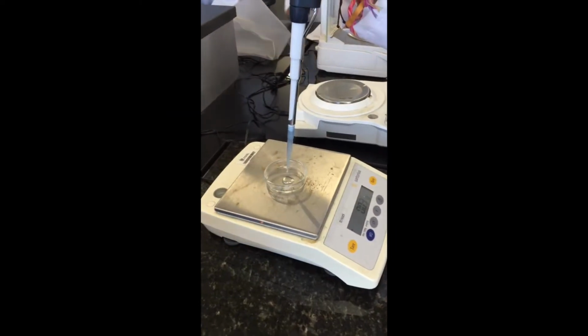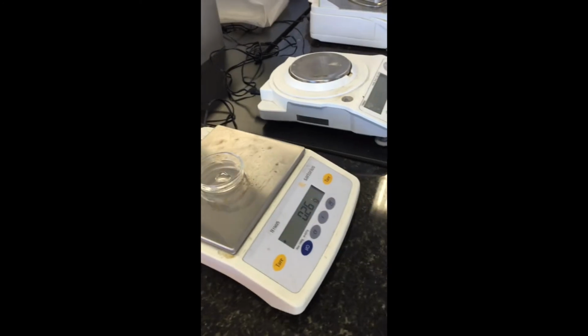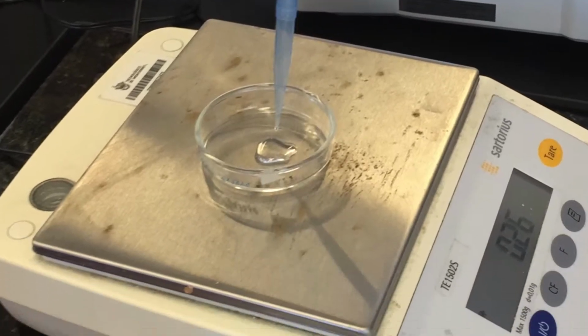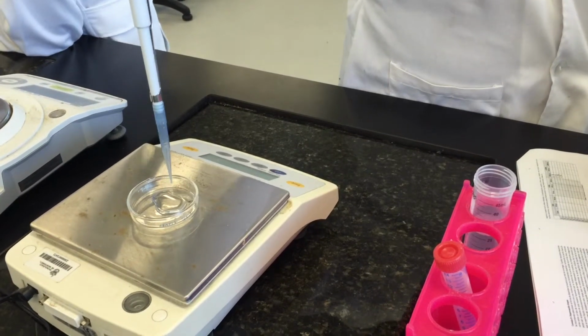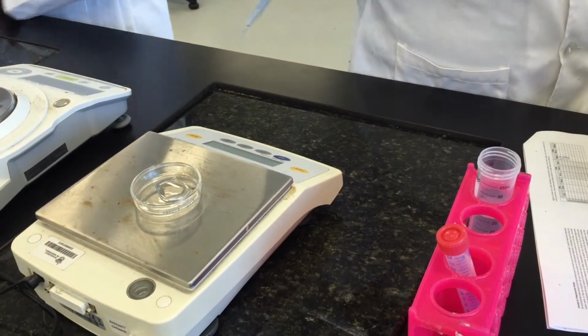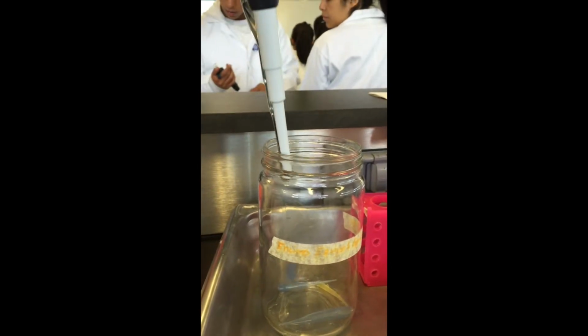In this practice, a review of the different material and equipment presented in the laboratory was made, with the objective of knowing how those are, how they work, and how we can use them. On the other hand, the pipetting technique was developed in order to understand the use and utility of the pipettes and how to make a correct measurement of different volumes. Also, the way the pipettes are set was reviewed and how you can give them a misuse.